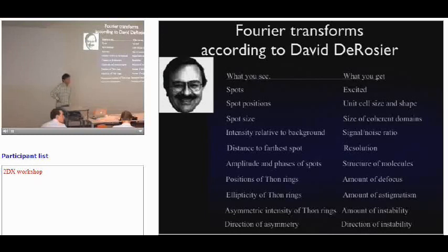Bono told me many years ago that if you want to go better than 5 angstroms, you have to deal with beam tilt. That's where single particle microscopy arrives now, and now they start looking into details.